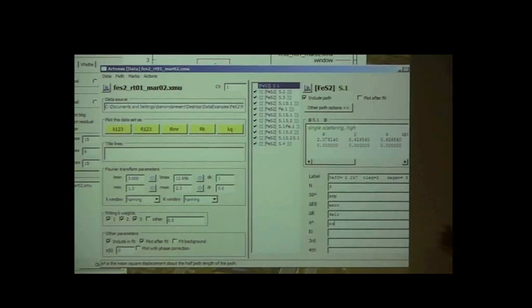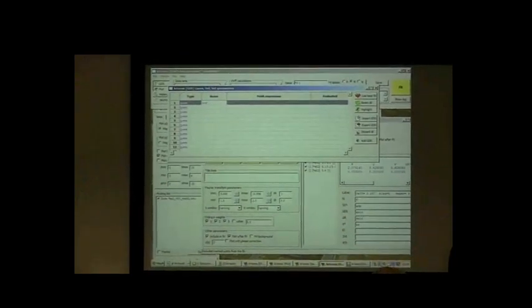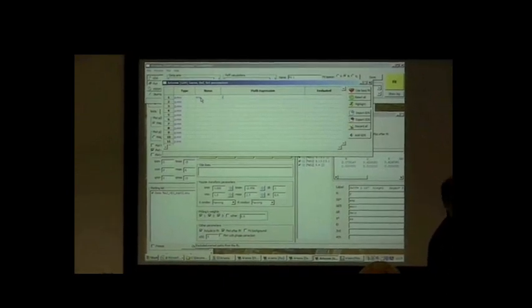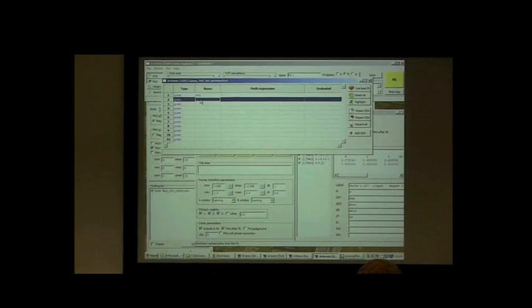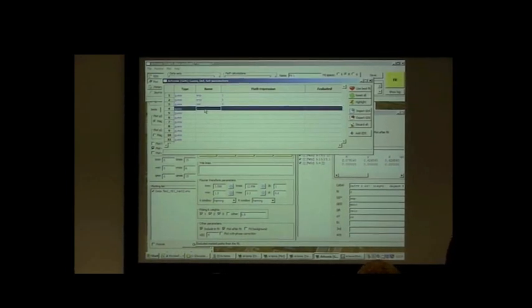The crazy part is that I have to open up this window up here that says GDS, and I have to guess an amplitude parameter and give it a starting value. The starting value I will give it is 1. Same thing I need to do: I need to guess an E naught, and I will guess it to be 0. And so on. That I will also guess to be 0. And the sigma squared parameter I'm going to guess to be something slightly larger than 0.